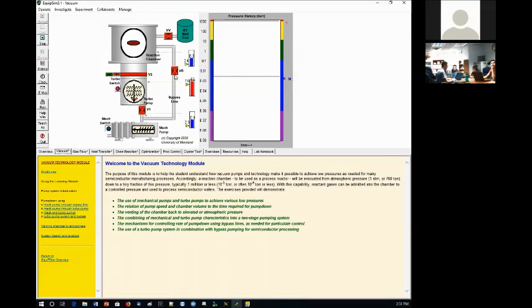So I just closed this valve here, and this reaction chamber, I can see them on my monitor. Right now, I mean, Marvin would say, oh, this is too ideal. You never have this kind of stabilized pressure. There's always a small leak somewhere, right? So this is the ideal world. We have no leaks, nothing, so good.